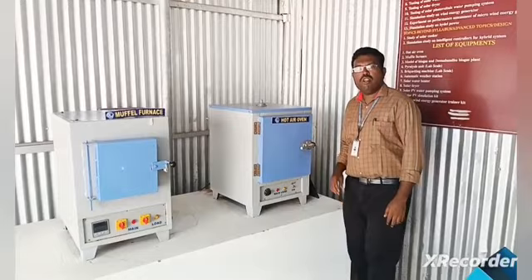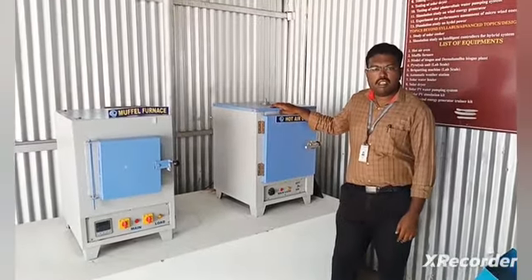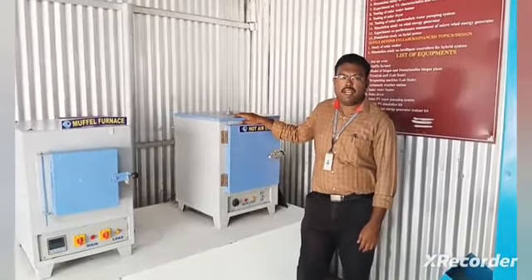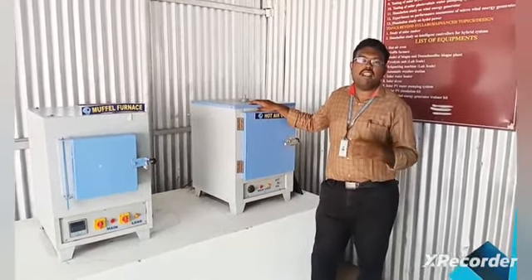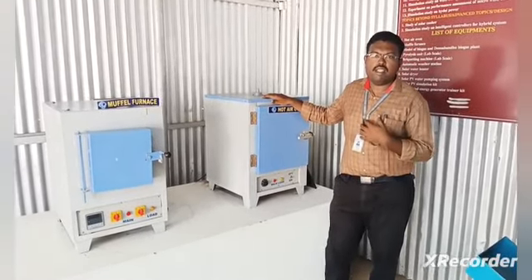Welcome all. Today we are going to see about characterization of biomass, in which we are going to make the proximate analysis. In this proximate analysis, we are going to calculate the volatile matter for the given biomass material and the ash content for the given biomass material.